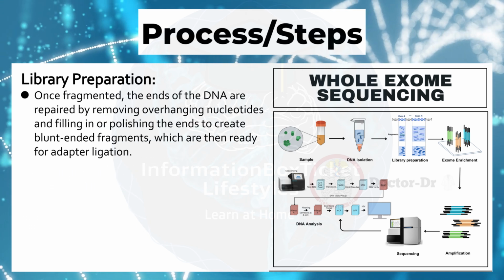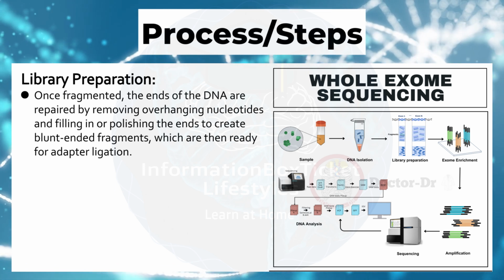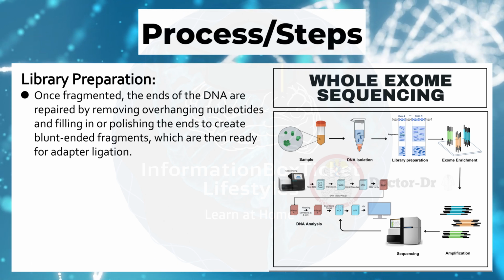Once fragmented, the ends of the DNA are repaired by removing overhanging nucleotides and filling in or polishing the ends to create blunt-ended fragments, which are then ready for adapter ligation.